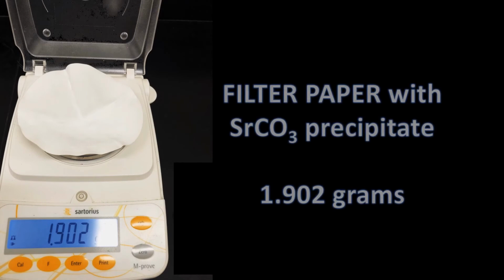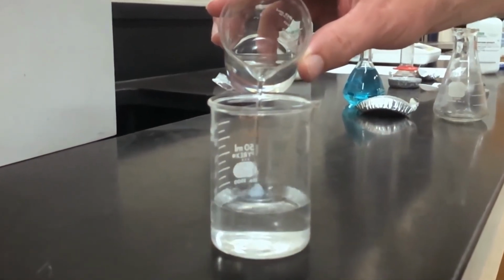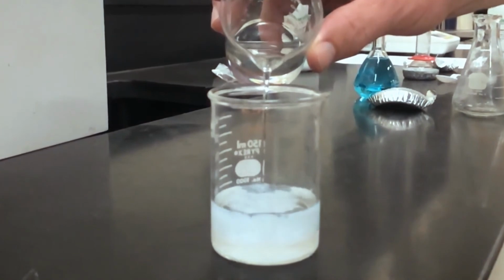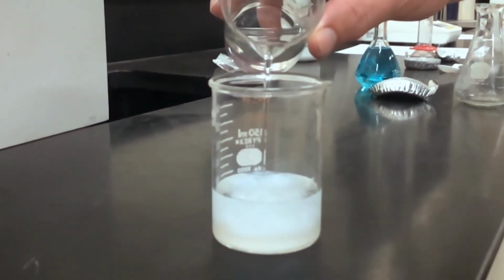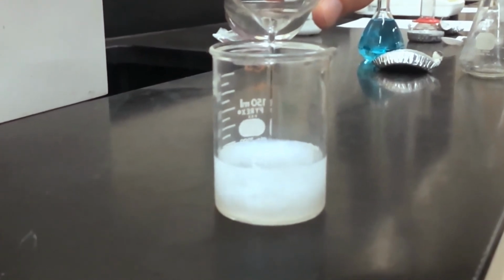It turns out that when we measure the filter paper with the strontium carbonate precipitate, it has a mass of 1.902 grams. This can be used to calculate the mass of the precipitate. And now, one more time, the reaction where strontium carbonate is formed inside that beaker.